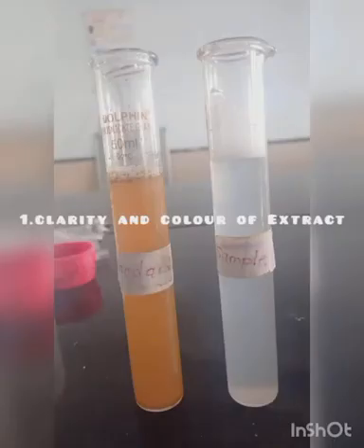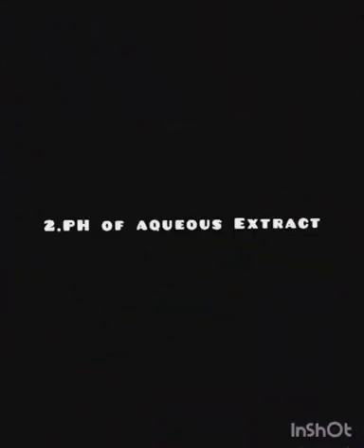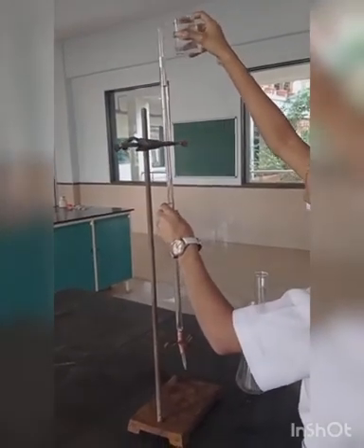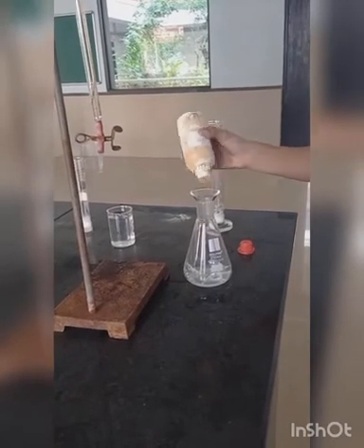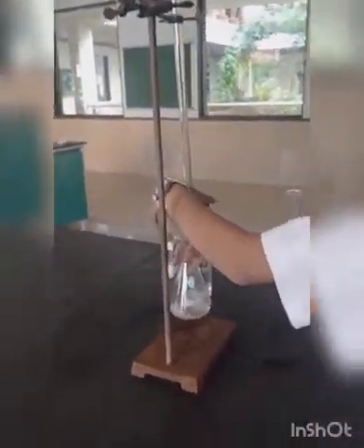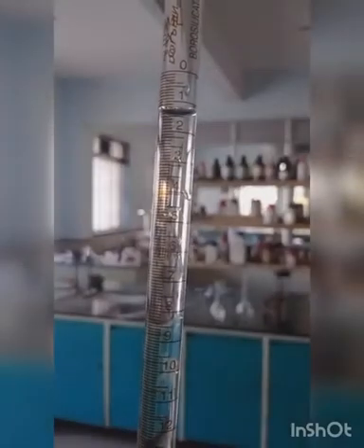After that, we perform the tests on the extract, that is on solution A. The first test is clarity and colour of extract — check that sample A is not more opalescent than the standard solution. The next test is pH of aqueous extract: fill 0.01 molar hydrochloric acid in the burette, then add 20 ml of sample A and 0.1 ml of bromothymol blue in a volumetric flask, and continuously add 0.01 molar hydrochloric acid until the colour of the solution changes to yellow. At pH 7, the colour of the solution gets changed.